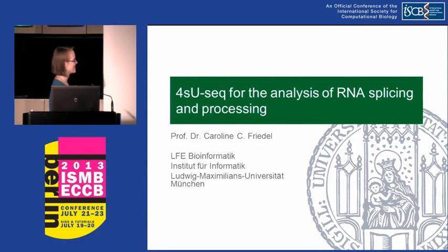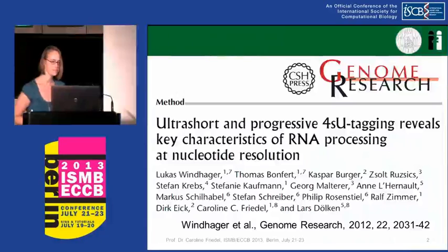So as you can see, I changed the title a bit compared to what you find in your program. Just to highlight a few key points of my talk: what I'm going to talk about is 4sU-seq, a new RNA-seq technique, which allows us to analyze RNA splicing and processing in more detail.